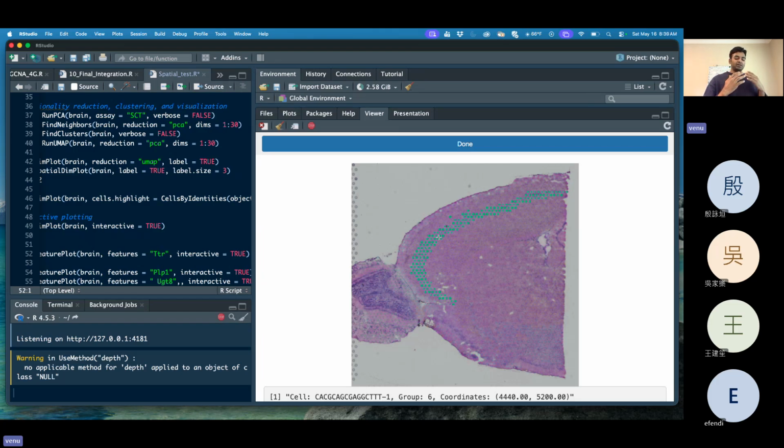That means the epithelial cells are closely associated with the CD4. That is the microenvironment level, TME level. We are understanding the proportions. In the first layer, all are epithelial. There is also a second layer, a second population involved in those spots. Did you get my point, Professor?